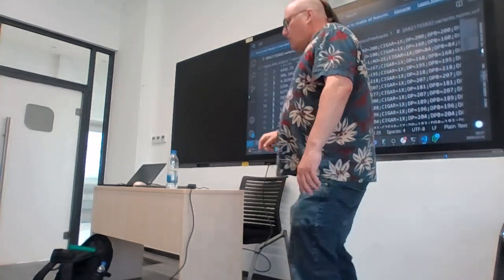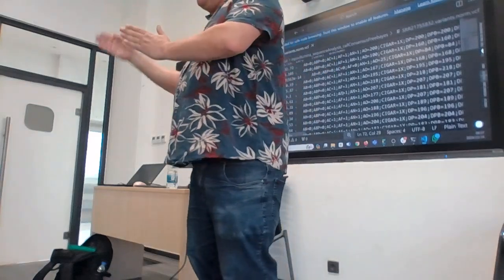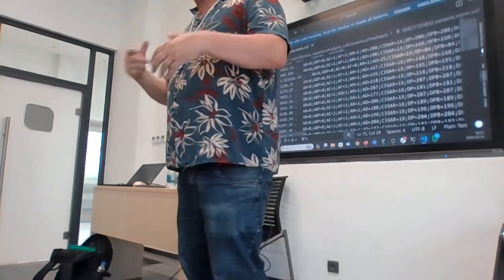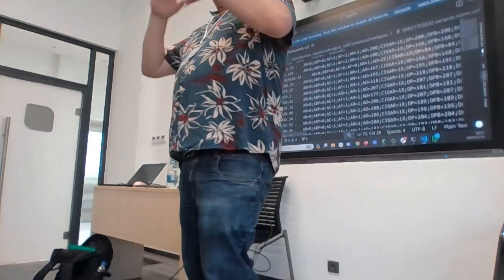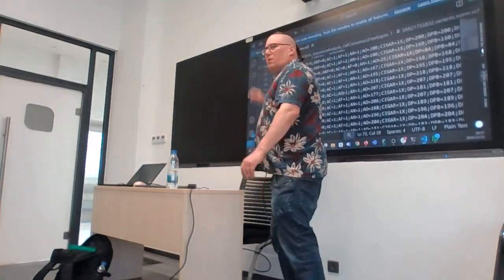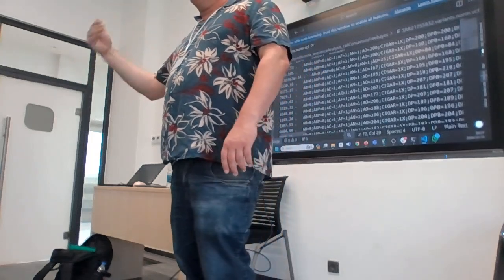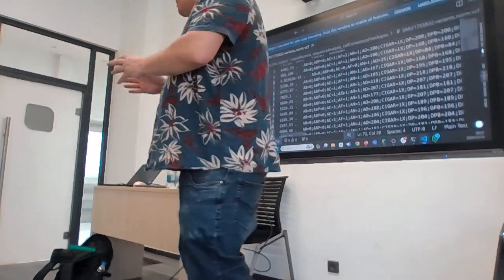AF is 1. That means AF is a number between 0 and 1, okay? You can think of it like a percentage, right? So AF of 1 means all of the reads are saying it is a T. If half of the reads said it was a T, AF would be 0.5, because half of the reads, okay?